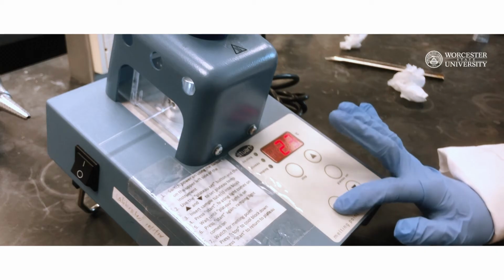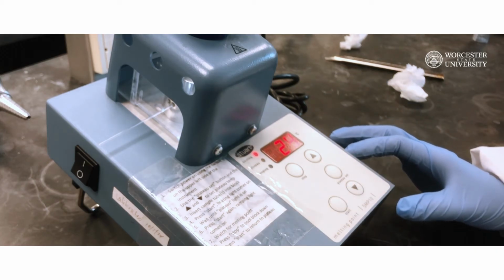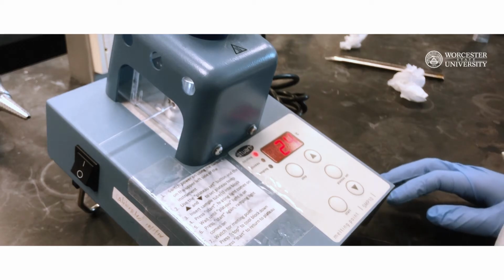After that, press the start key. The apparatus will quickly heat up to the plateau temperature. You will see the heating light light up.